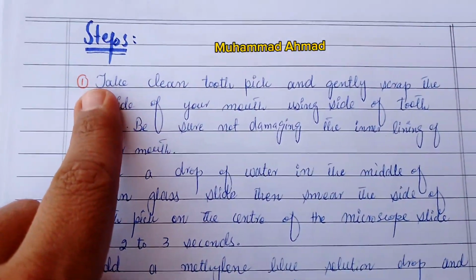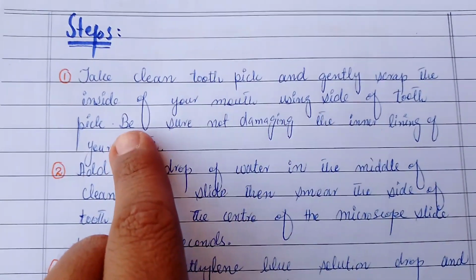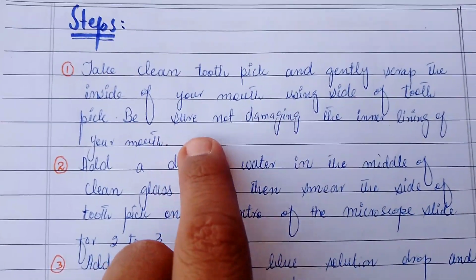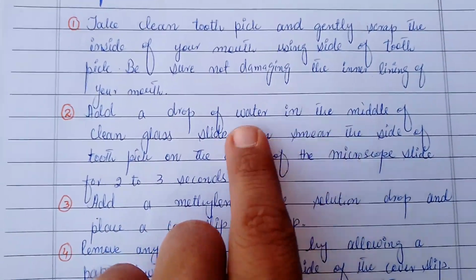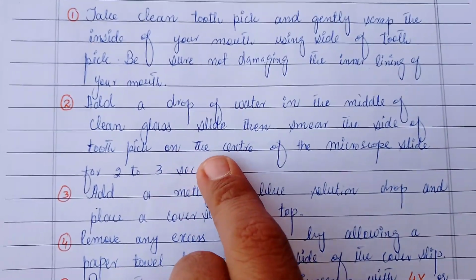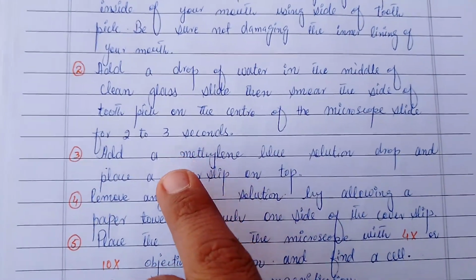Steps: Point 1. Take a clean toothpick and gently scrape the inside of your mouth using the side of the toothpick. Be sure not to damage the inner lining of your mouth. Point 2. Add a drop of water in the middle of the clean glass slide, then smear the toothpick on the center of the microscope slide for 2 to 3 seconds.